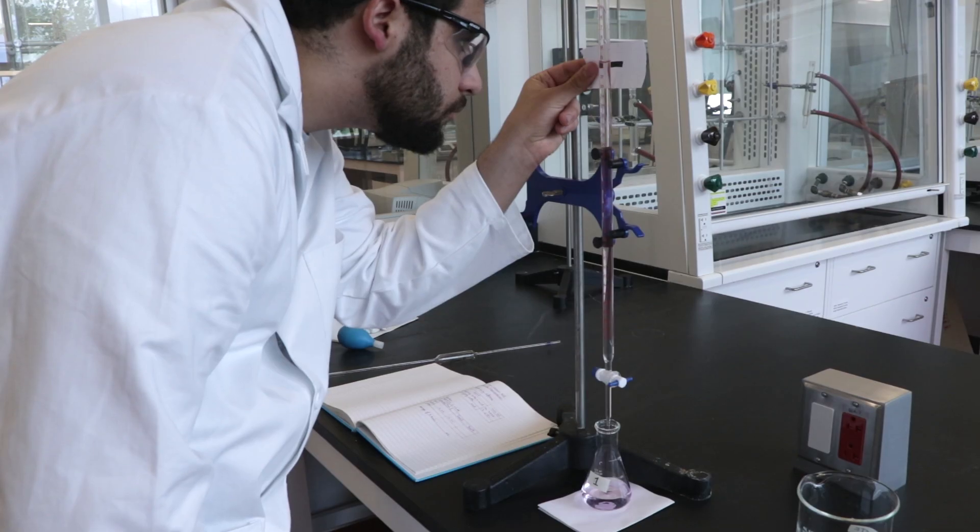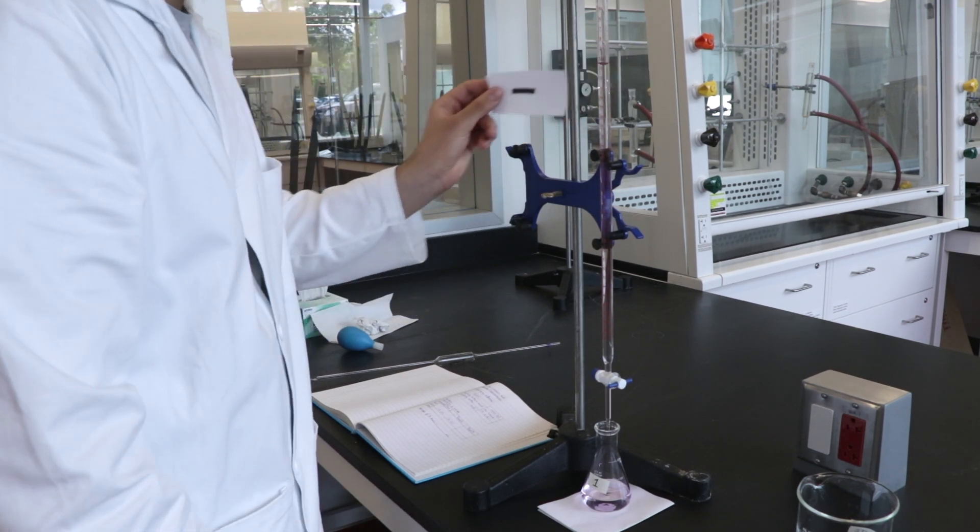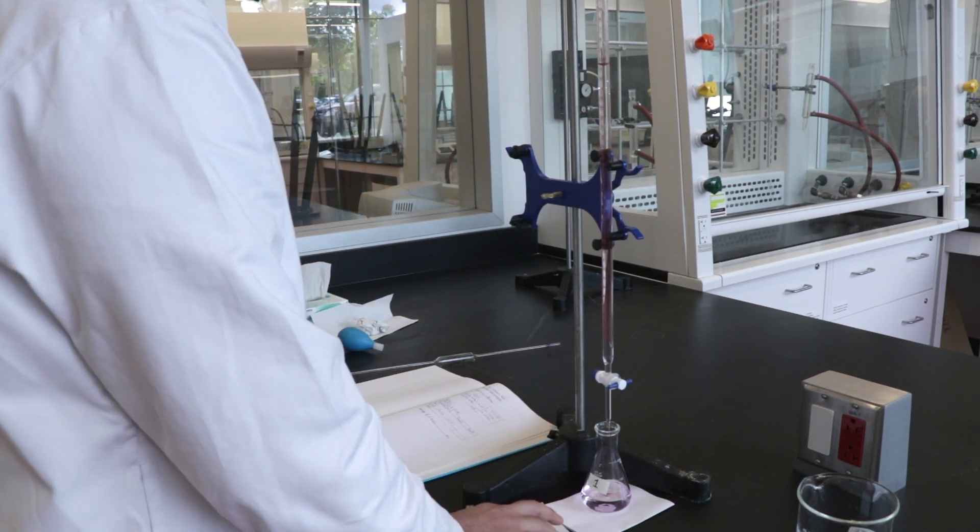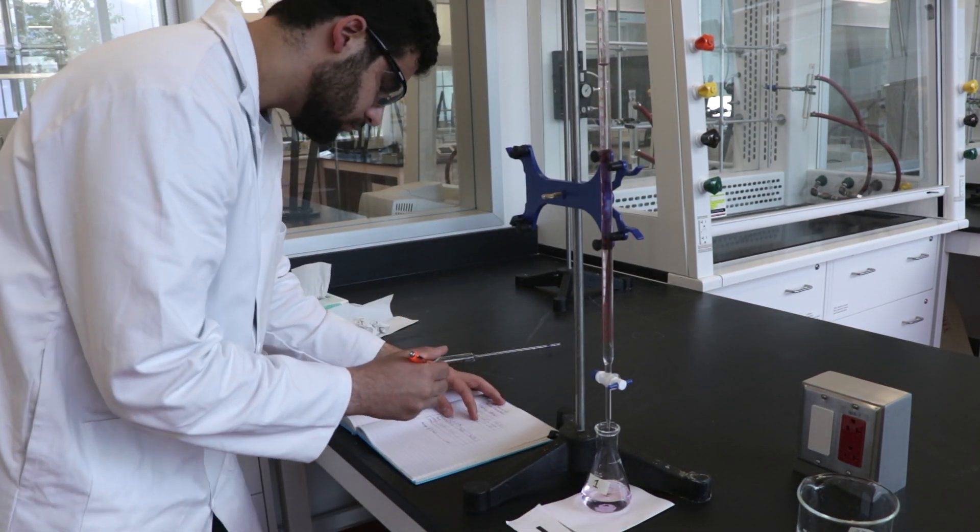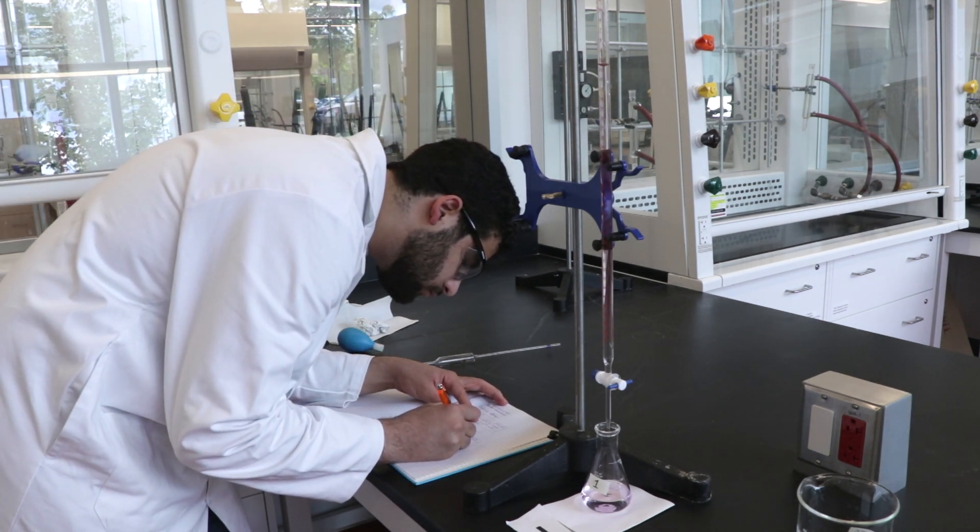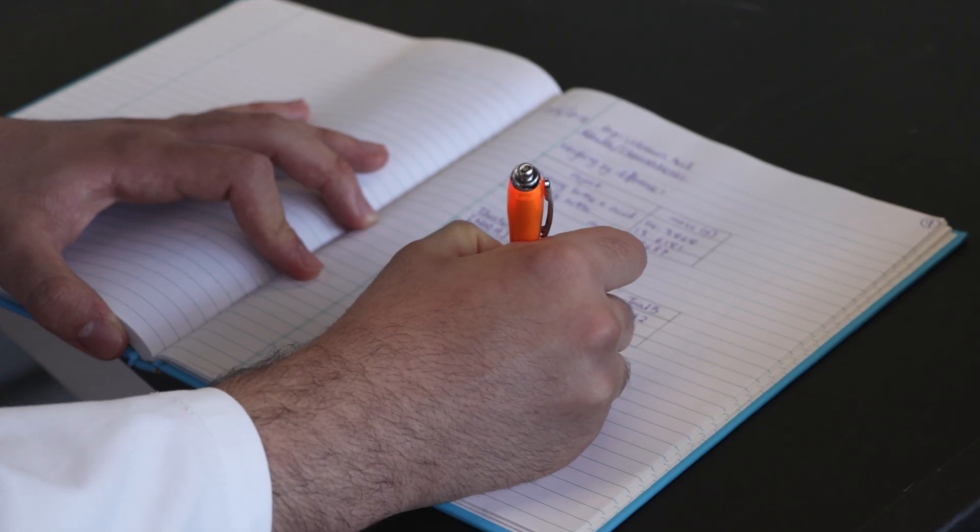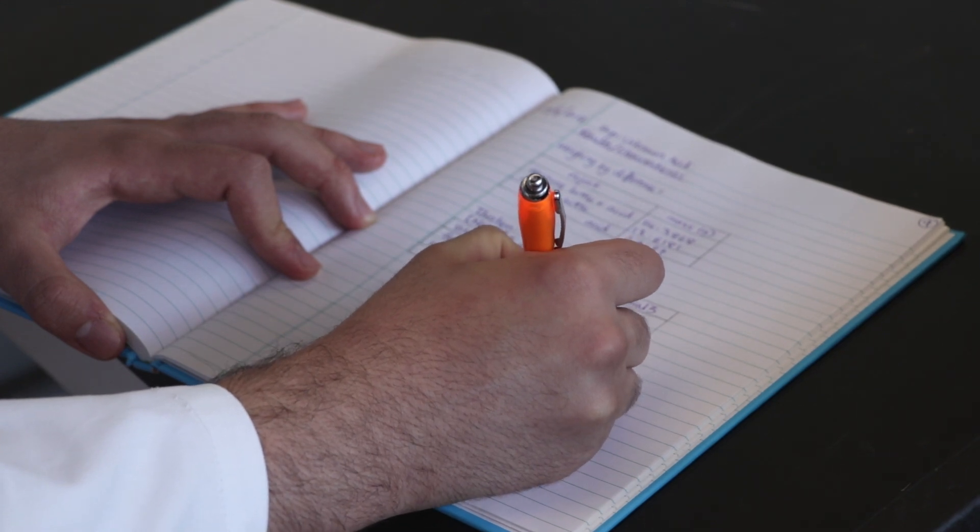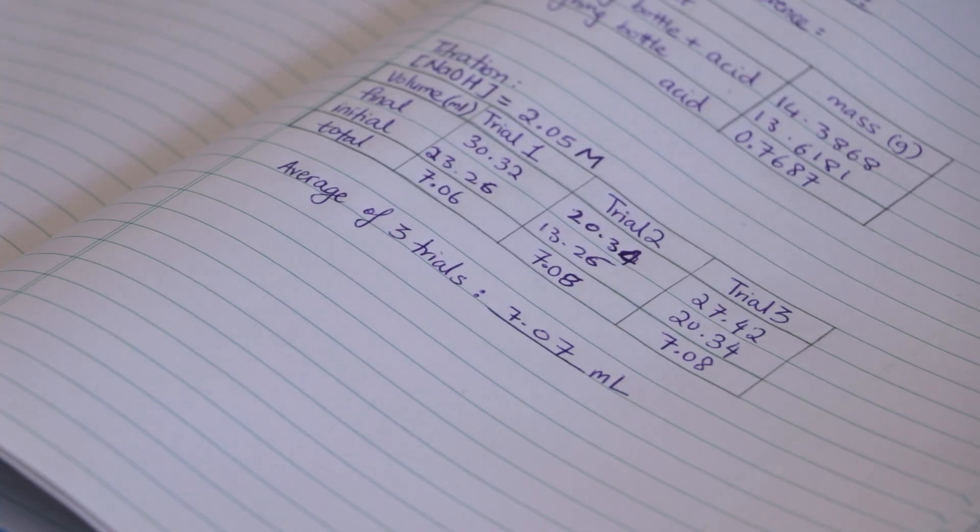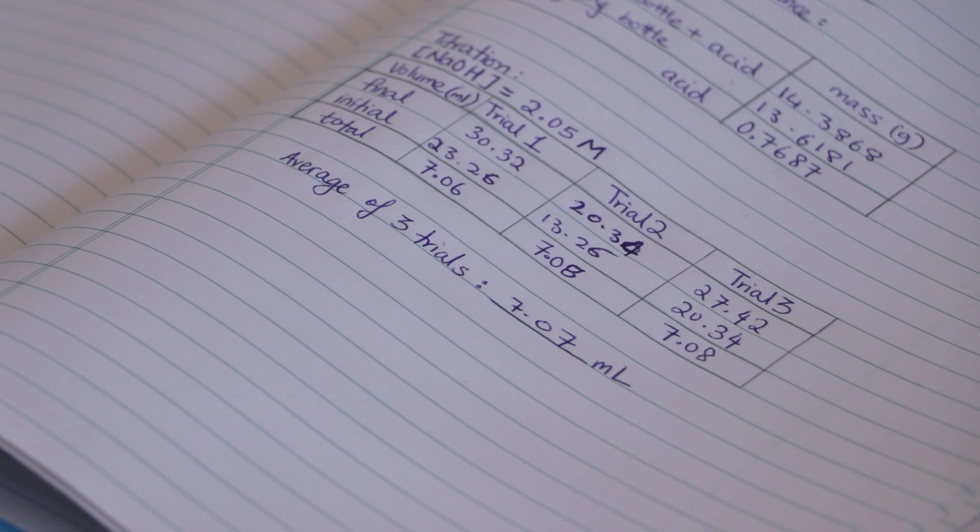Once you have reached the endpoint, read the final volume from the burette and record it in your lab notebook. In your notebook, subtract the initial volume from the final volume to calculate the amount of sodium hydroxide solution needed for the titration. Repeat this process for the remaining two flasks and calculate the average for the three trials.